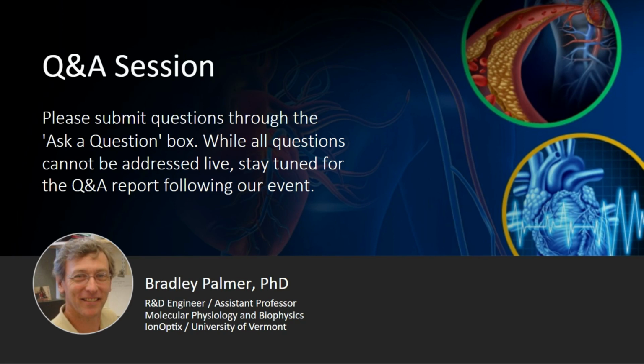But so far, what we've experienced and what I've seen other laboratories experience is that you can keep the myocardium on ice without it being frozen, and you can still transport it over a 24-hour period and still then make your slices and still expect to get reasonable force generation and viable cardiac slices from that kind of situation.